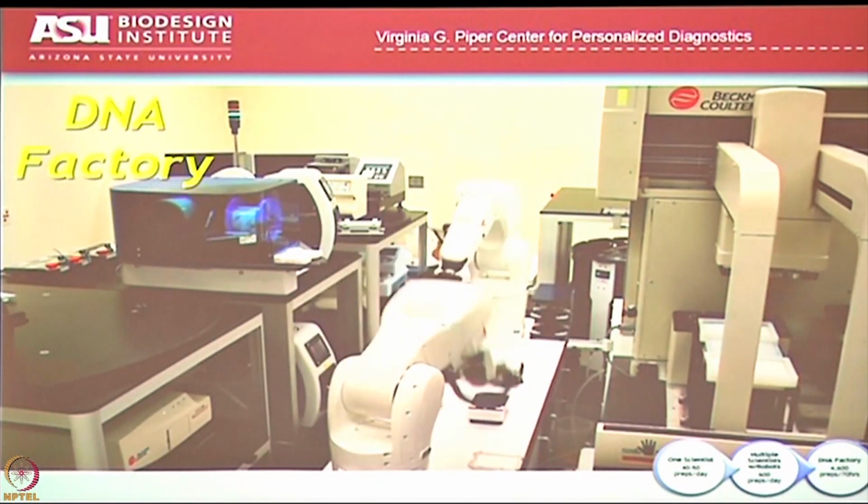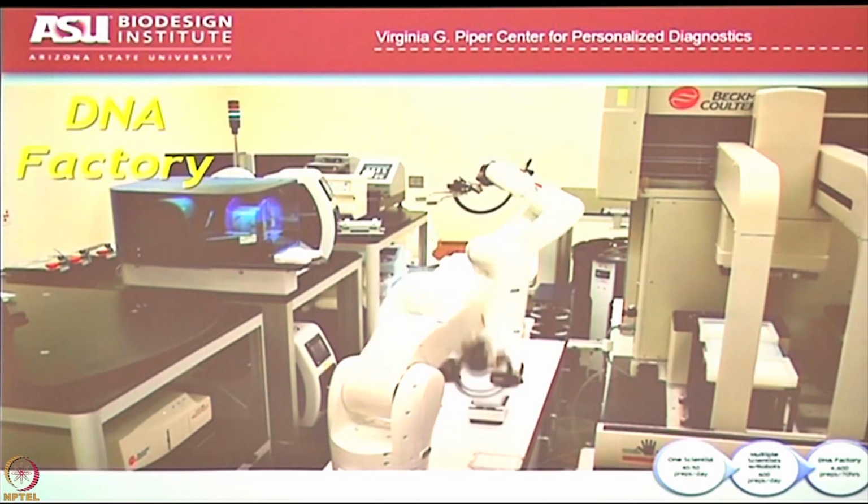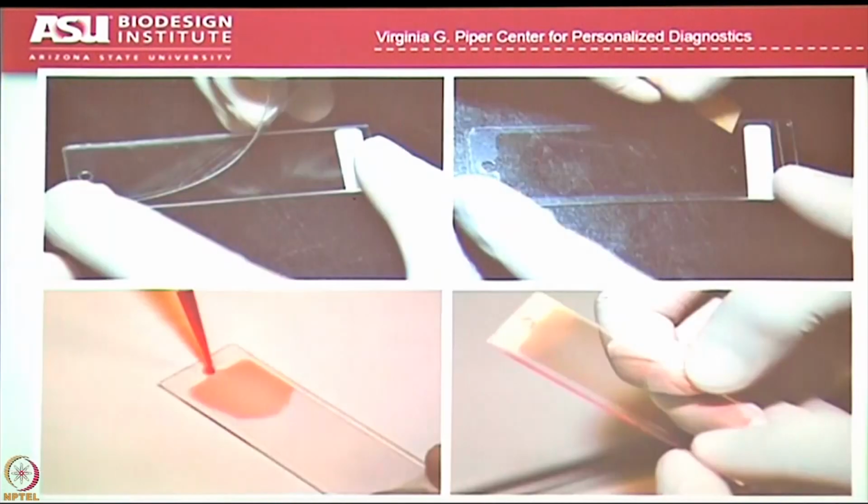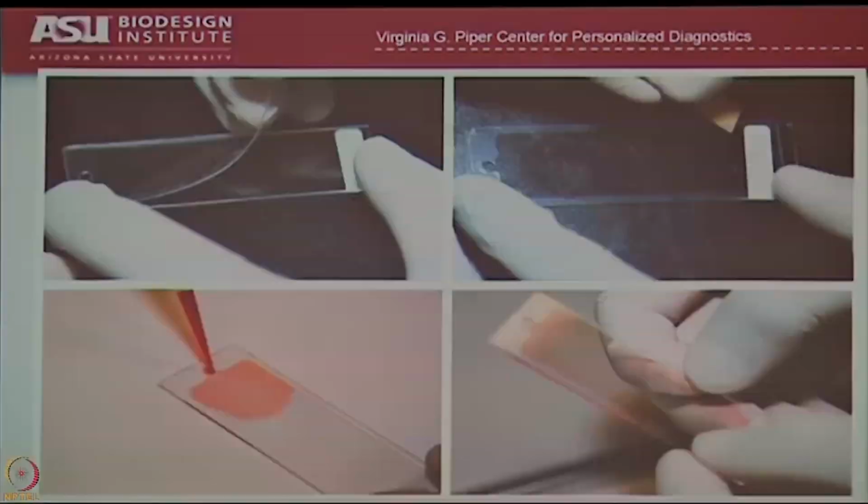So it really accelerates what you do, and it also gives you a little bit more certainty that what you're doing is working. So this is how we actually make the chips. And I think you guys have examples of this at your desks. You have this cover slip here that you put on the chip. There's a little hole here and a little hole here. You inject your lysate in here. You fill it all up. Make sure you don't get any bubbles. That's always the trick. One of the things you have to learn how to do. And then you can make the proteins on the chip using this approach.